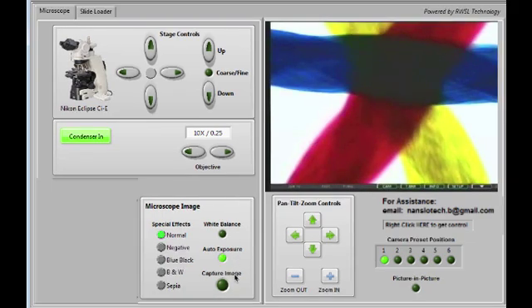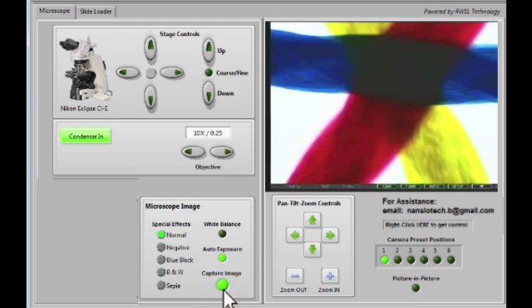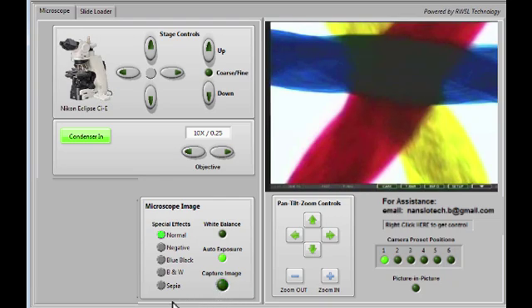Once you've found something that you want to save an image of, click the Captured Image button here. When the button turns dark again, that means the image has been captured, and you can view it by clicking View Captured Image.